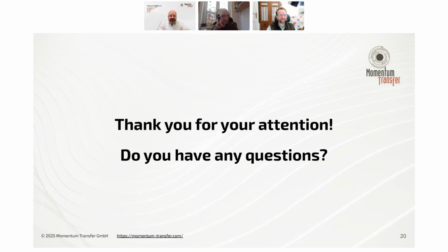How does it handle background? We don't need to work on background as far as I can see. Yeah, that's actually a really good point. There are two components to that. On the one hand, there's your experimental background. We remove that from all of the data that we measure: we measure it and subtract it. If you have data from your own source, you would need to do that beforehand. Of course, there's the other component, which is diffuse scattering from your sample.